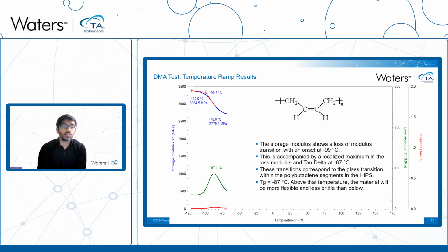In some cases, low temperature transitions like these are often associated with good impact properties. This type of secondary transition may indicate improved impact property of the material at lower temperature levels due to the rise in the loss modulus or viscous properties.